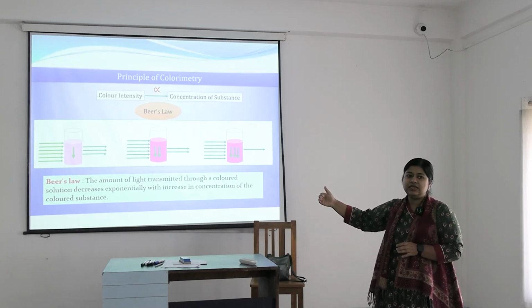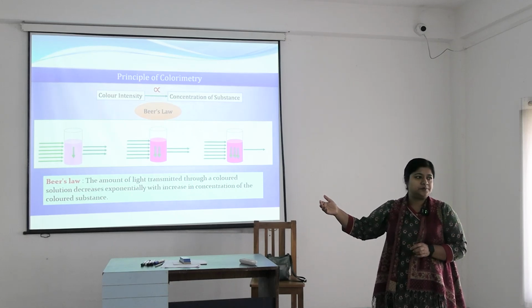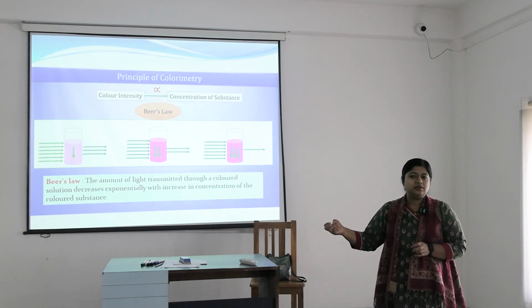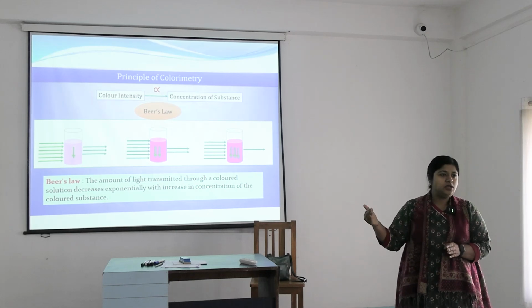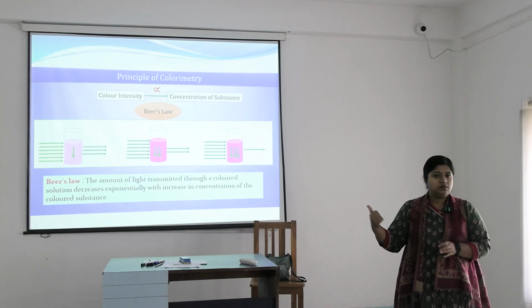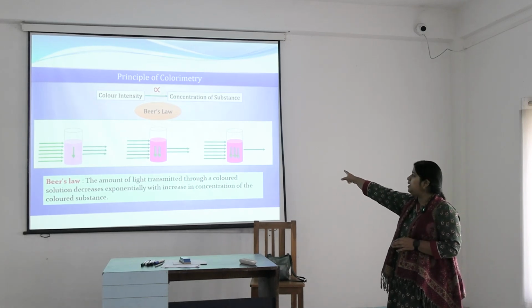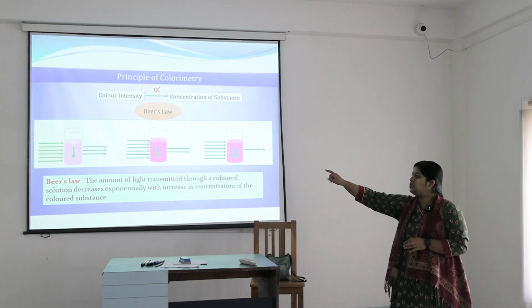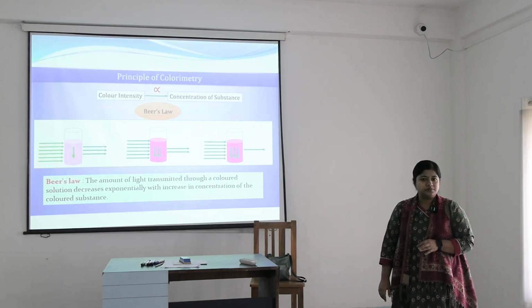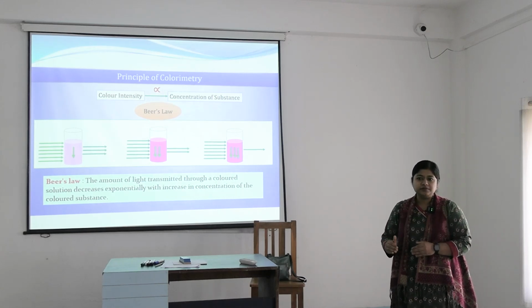Along with the intensity increase or concentration increase, what else is increasing? Absorbance. The power of absorbing the light is also increasing. That's why transmitted lights are getting low. The darker the solution, the lower the transmitted light. Understood? In the darkest solution, only one arrow is getting transmitted, whereas in the light solution it was transmitting three arrows. So with increasing concentration, transmittance is getting decreased.